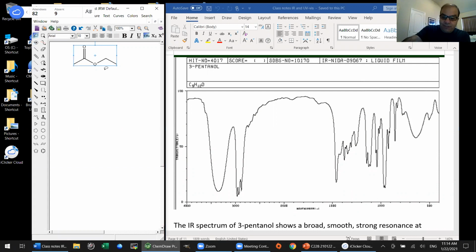So here is a typical alcohol. This one is 3-pentanol. And again, we haven't officially learned how to, well, I guess we did learn how to name alcohols. We did chapter 17. But I think that's something that you could probably come up with the structure given the name, 3-pentanol, so 5-carbon chain, and the OH group is in carbon 3, 3-pentanol. And I think everyone can see this nice, broad, very beautiful, very symmetrical, very smooth peak over here. And that is your OH stretching frequency.